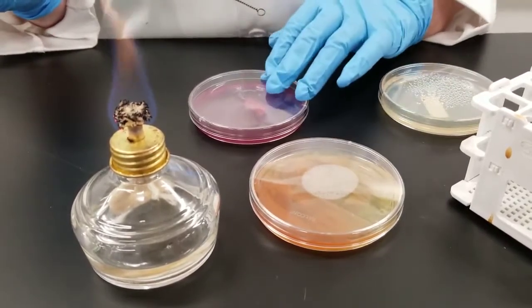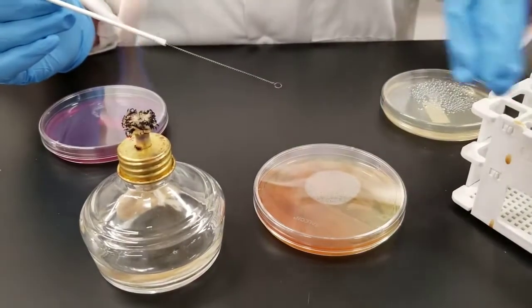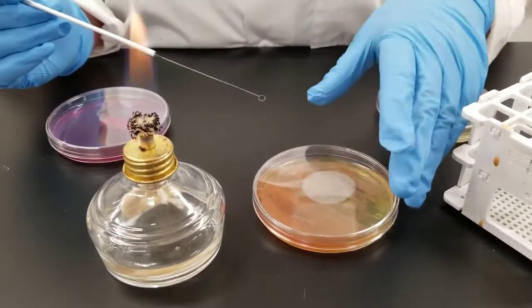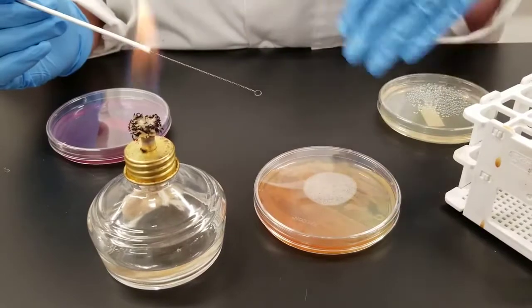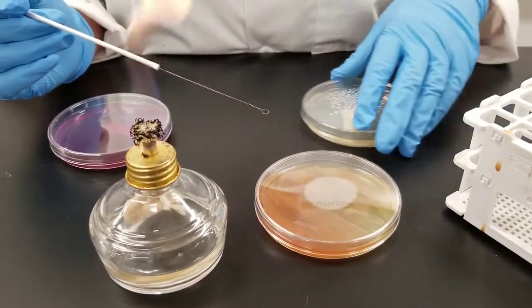Do not be waving it around in the air because you can pick up contamination. You always want to be working within six to eight inches of your flame. That is considered your sterile area. You move way outside of that and you're no longer in the sterile area.